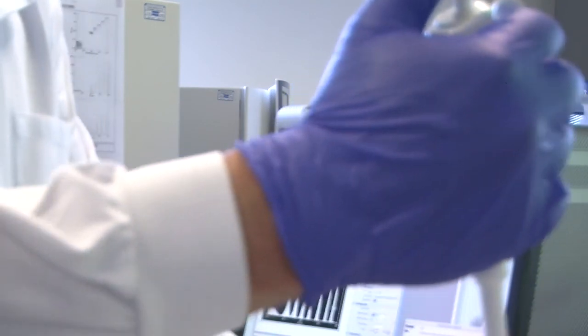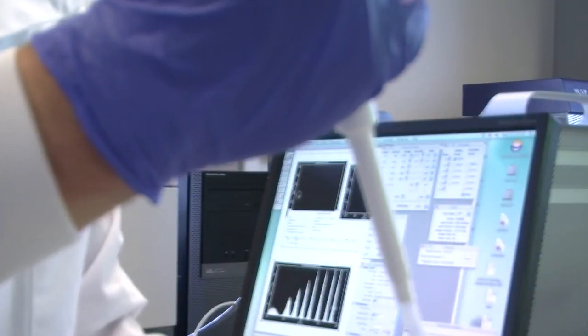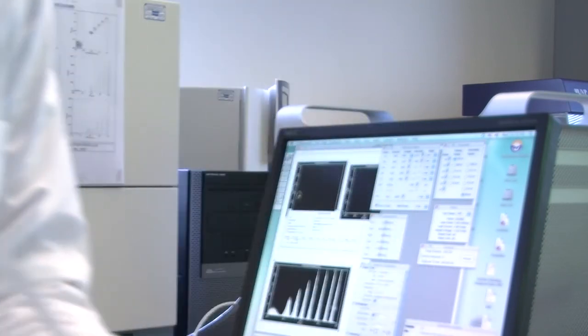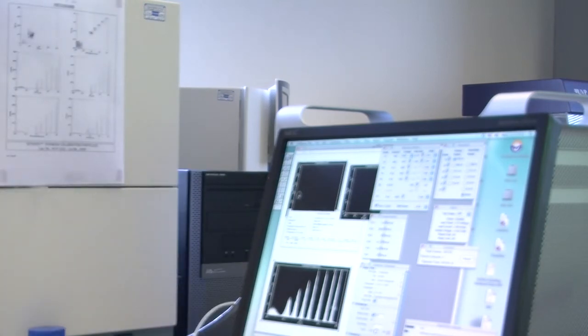So the forward and side scatter are the size and the granularity readings. You can look at it in all different ways. When you're reading papers and they're showing you this, we will go through it. We'll have a paper, and check: are they all keeping the same standards?